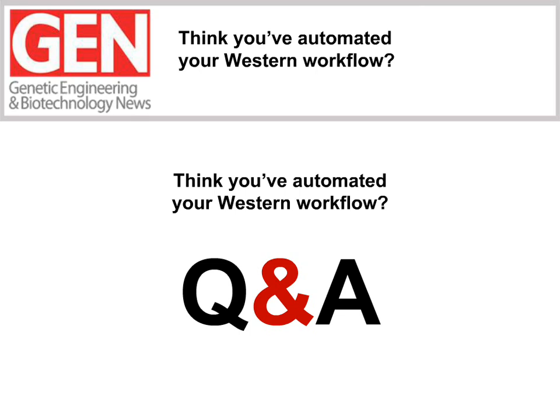All right, Andrea, this is the final question. How does antibody dilution used for detection affect the results? The dilution of your antibody in Simple Western will be very similar to what diluting an antibody in a traditional Western would be like. If you use too much antibody, you'll have more background. And if you don't have enough, you won't necessarily have the most optimized signal.